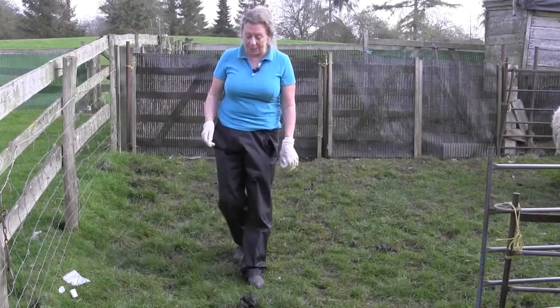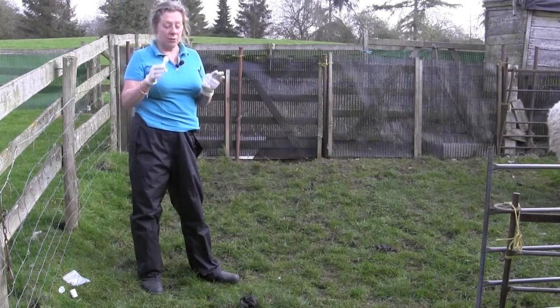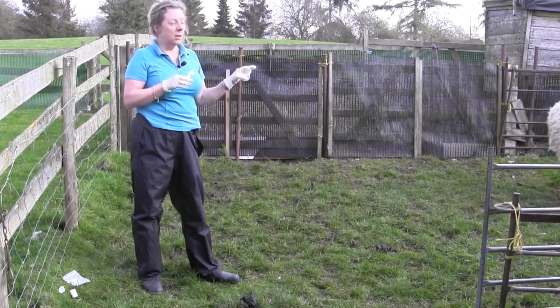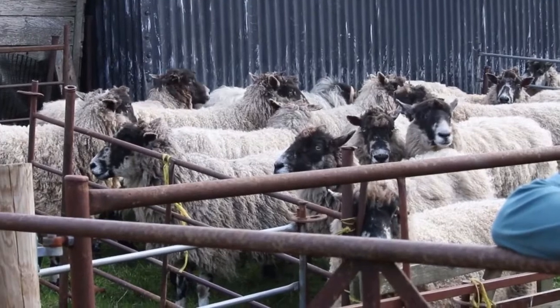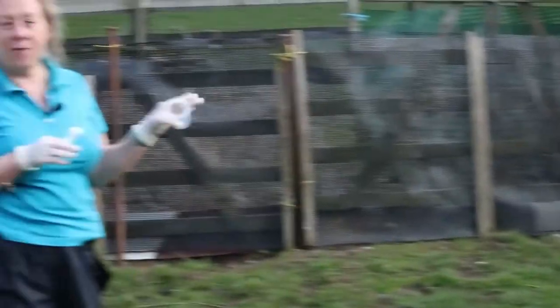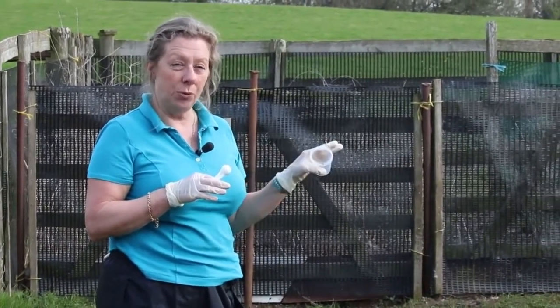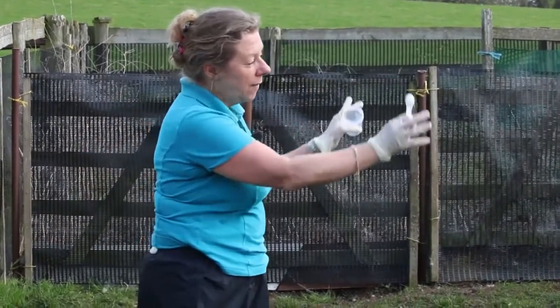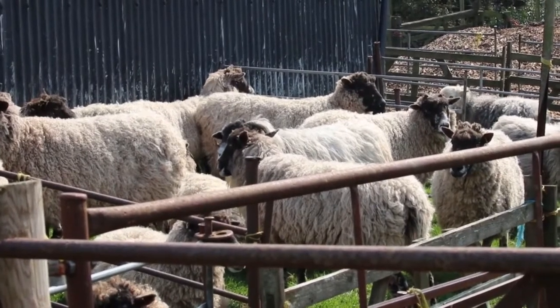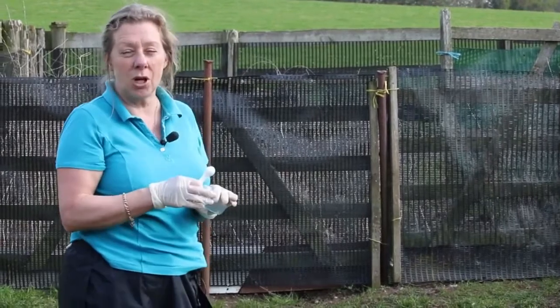If we're going to take a sample it's really important that we get a representative result for the whole group of sheep. We've got a small group here, and generally speaking, irrespective of the size of the mob, we want somewhere between 10 and 15 individual fresh samples. That's really important because otherwise there's going to be quite a variation within that group, and we need a random sample big enough so our answer is really indicative of what's going on.